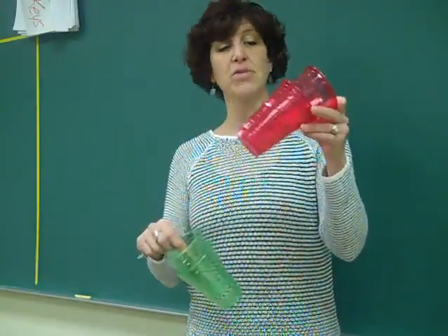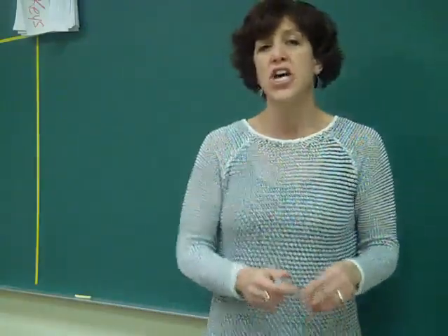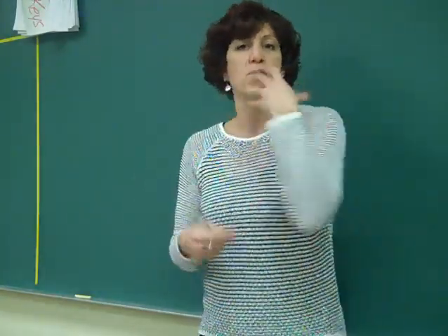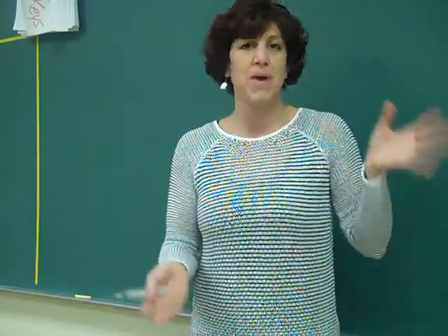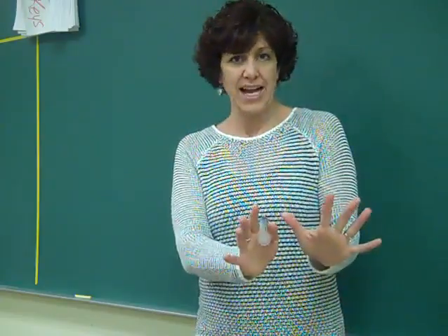Green light only coming through this, red light coming through this. If we have some other cups, we can do some other colors. You can add different substances. You can make it cold, you can make it warm, you can make it acid, you can make it base. You decide what cool things you want to do and try it out.